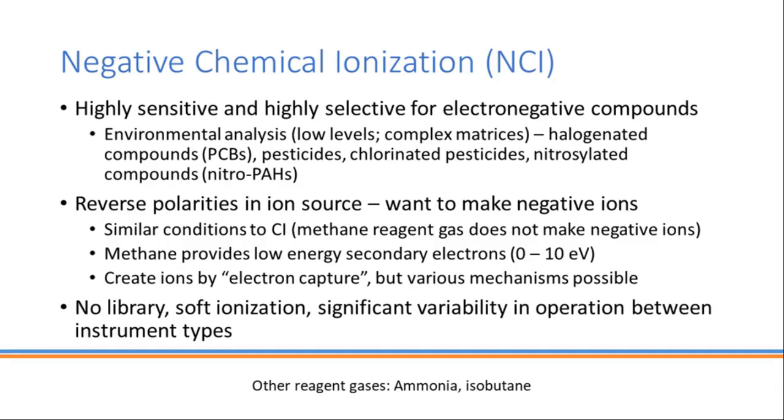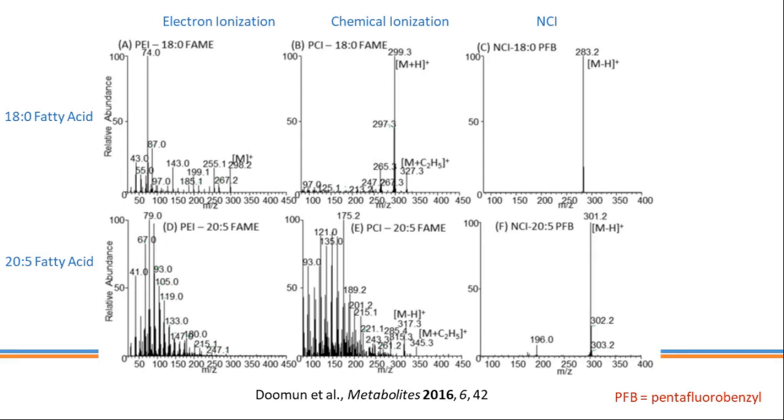It's mainly for quantitative analysis. It's not like we have a library, but it is a soft ionization technique. You can see some significant variability in operation between different instruments, but it's certainly a useful tool in the toolbox. I don't have a lot of time to show a lot of examples, but this is a good summary comparison that I pulled from the literature.